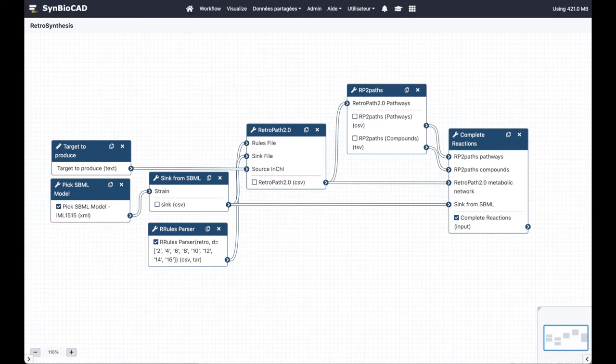The set of reaction rules is automatically downloaded from the retrosynthesis database and the sink is extracted from the strain model.